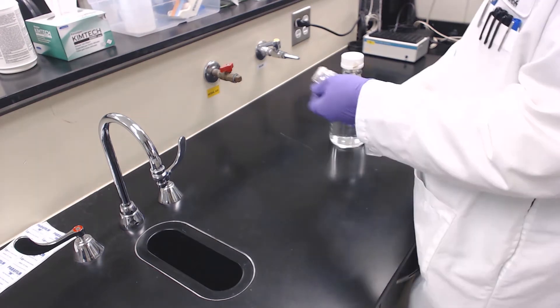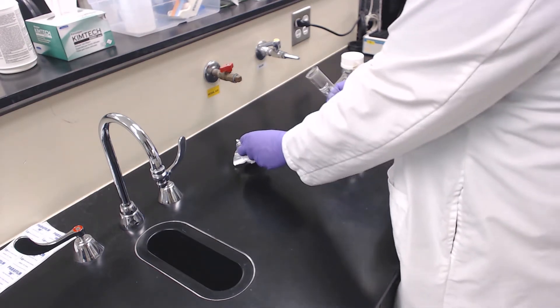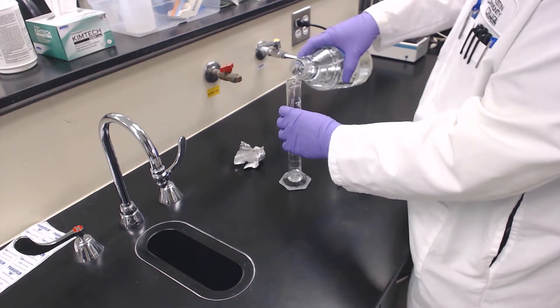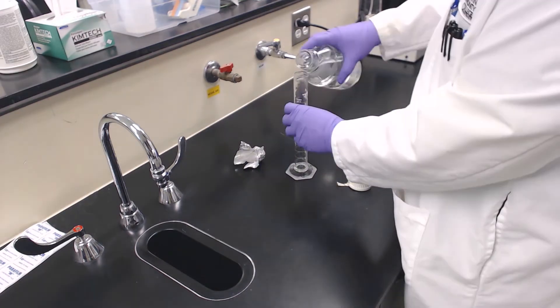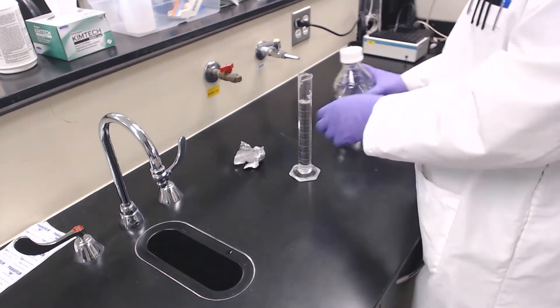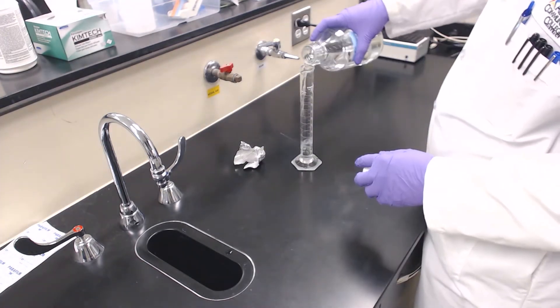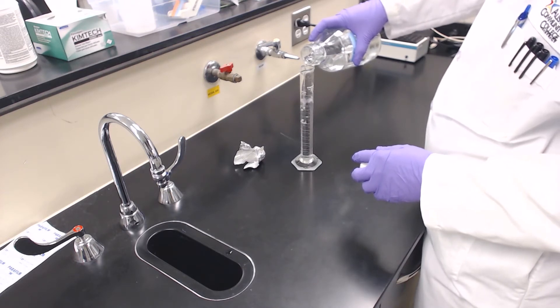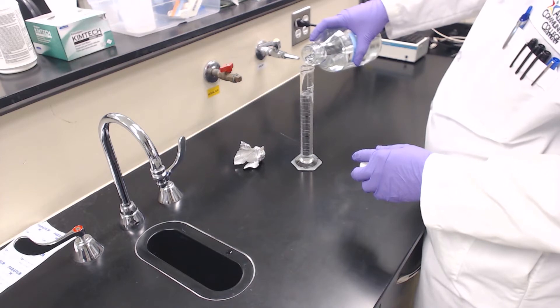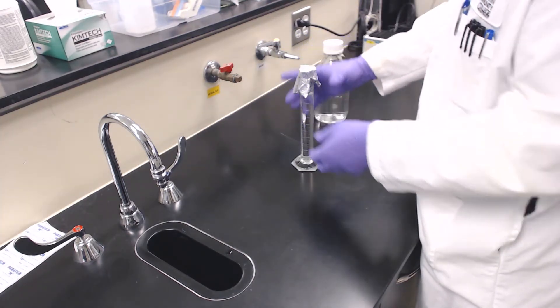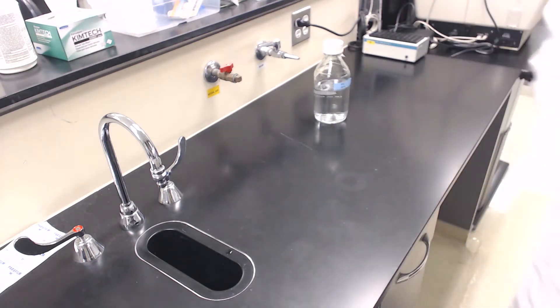Find the cleanest water source and begin with that one. Take your sterile graduated cylinder to the first water source and rinse at least 3 times before collecting 100 milliliters. Bring the sample back to your bench.